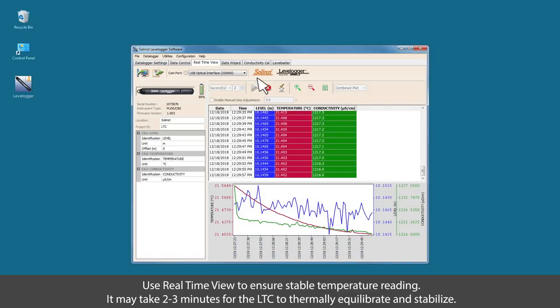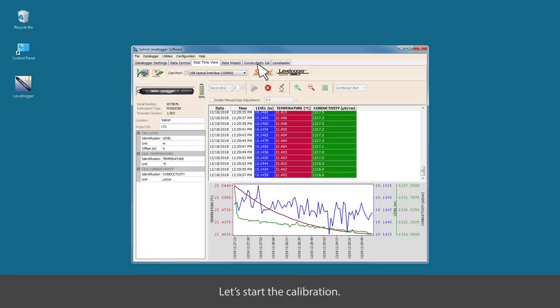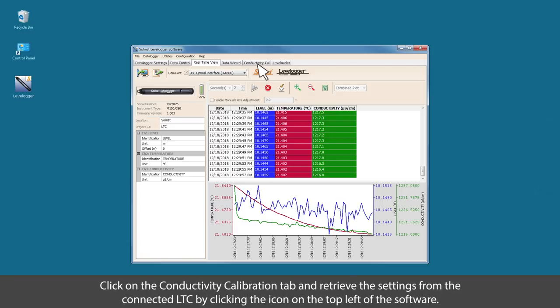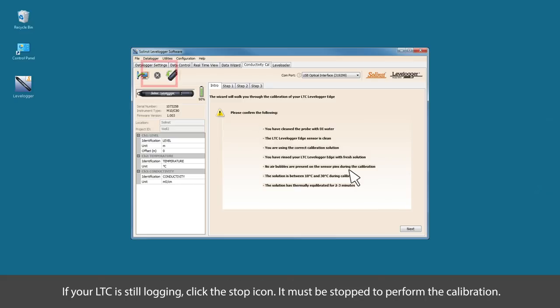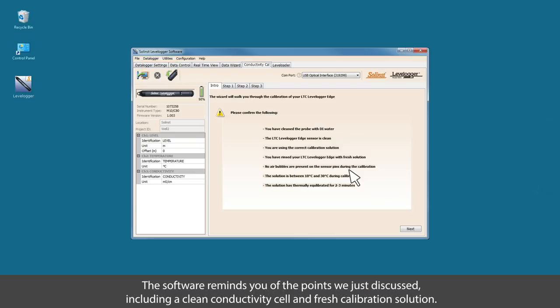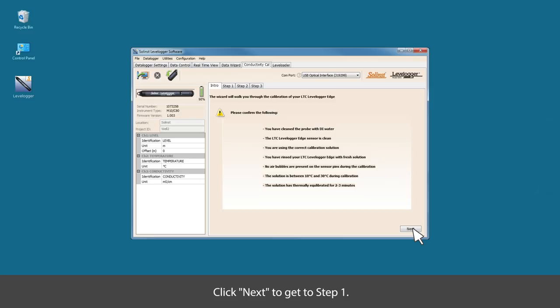Once thermally stabilized, we can start the calibration. Click on the conductivity calibration tab and retrieve the settings from the connected LTC by clicking the icon on the top left of the software. If your LTC is still logging, click the stop icon. It must be stopped to perform the calibration. The software reminds you of the points we just discussed, including a clean sensor and fresh calibration solution. Click next to get to step number one.